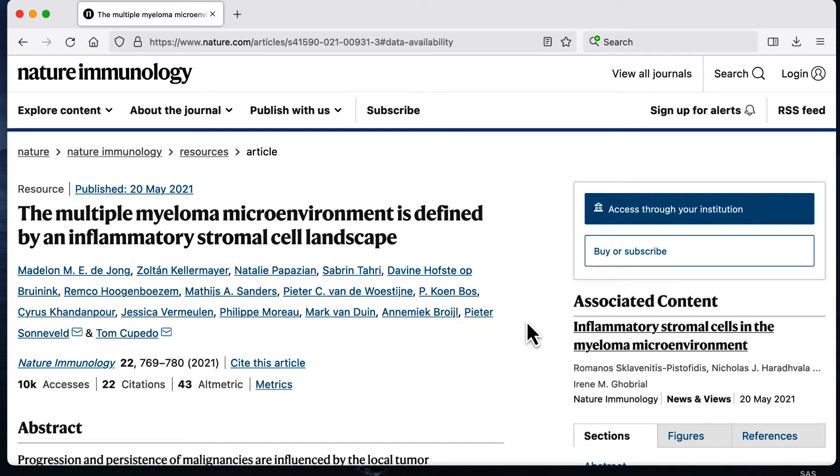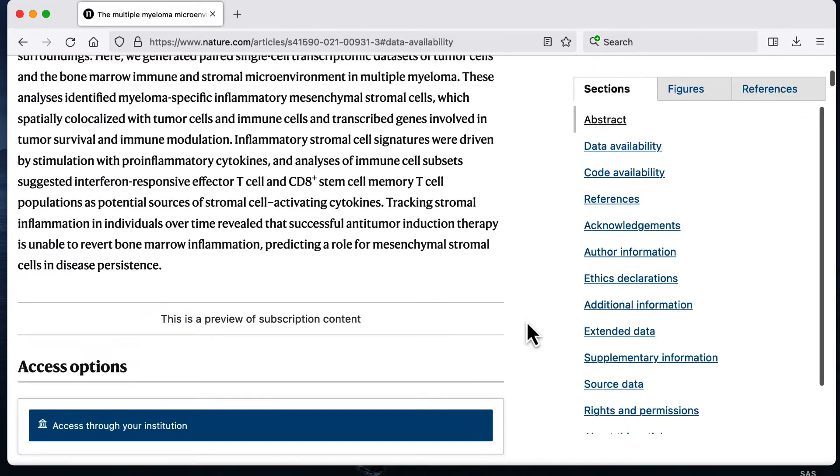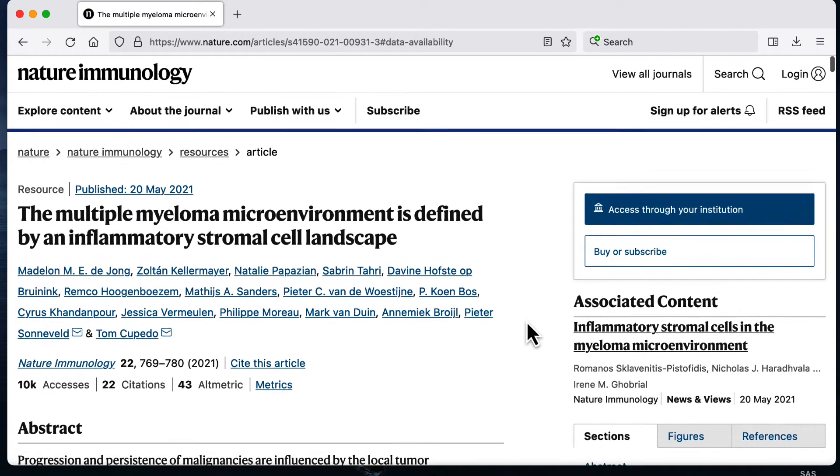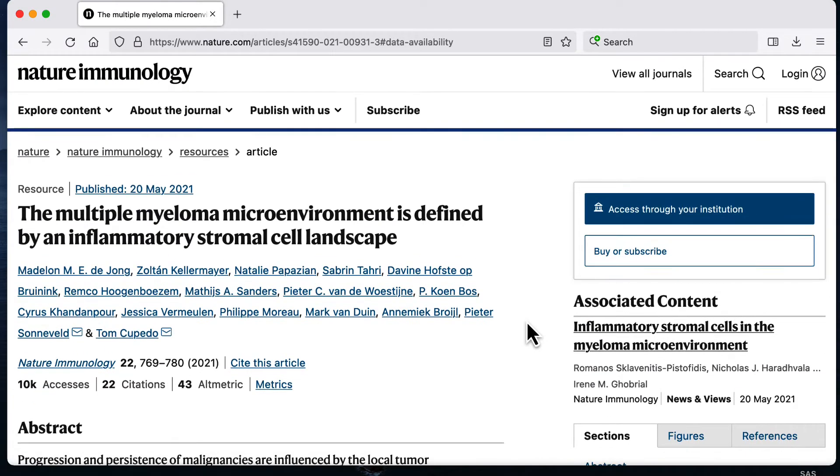I'm going to walk through how you could download the FASTQ files, which is the raw data from a publicly available dataset. This is kind of like the first step of some bioinformatics project that you might have to do. The first thing would be get the data.